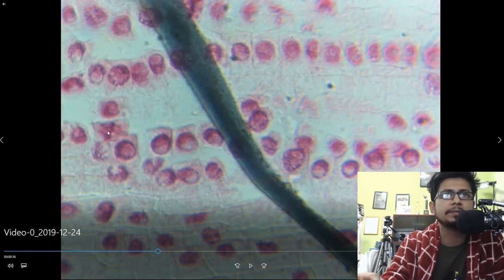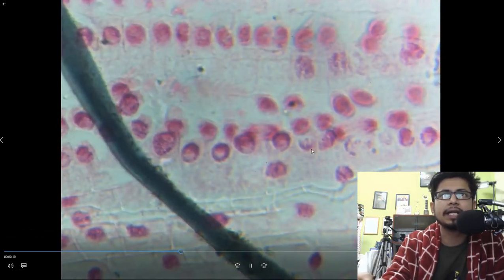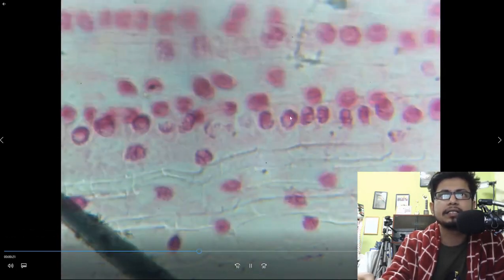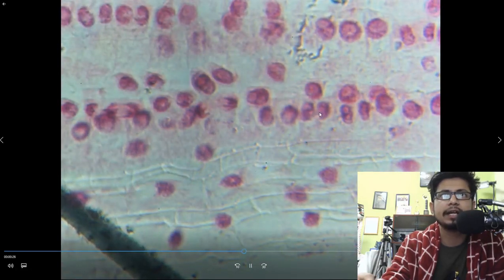This is prophase, this is metaphase, and this is where cytokinesis has been done very recently. This is very late anaphase. Continuing — this is also another anaphase, and these are also anaphase. This is right after the late anaphase stage.